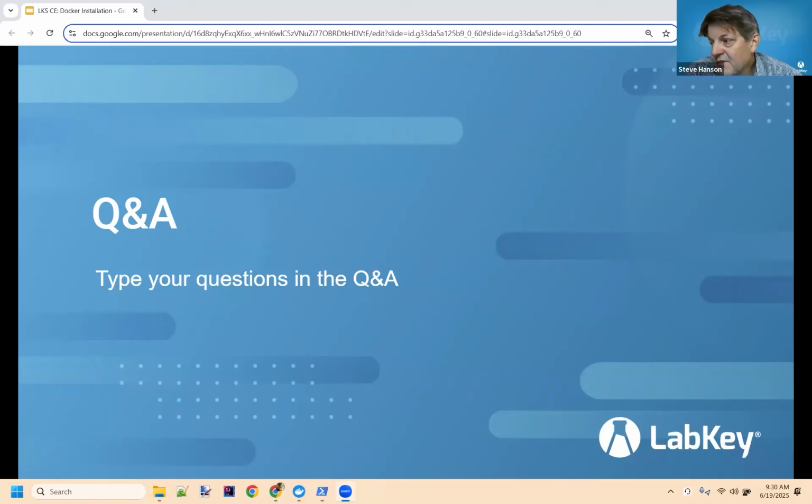Thanks for that. And another one asks, where is the support documentation for the Community Edition? The way to get to that is to go to labkey.org, and you'll see a big button that says documentation right there. Labkey.org is really the hub for all things Community Edition, including the tutorials and the documentation and all that.